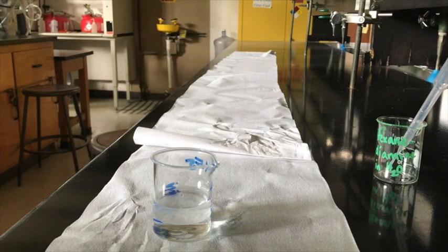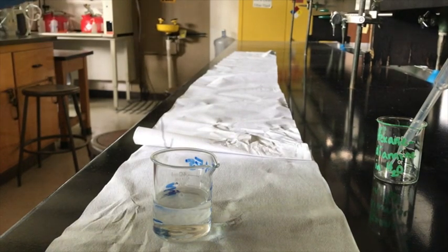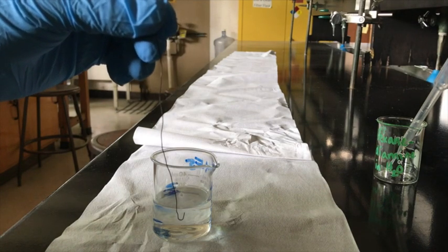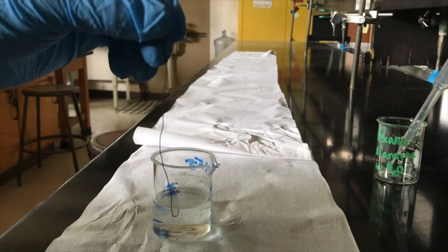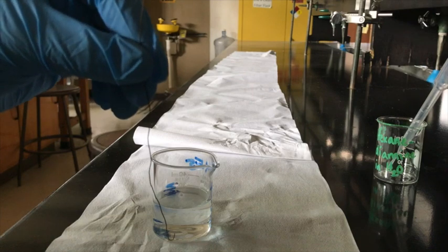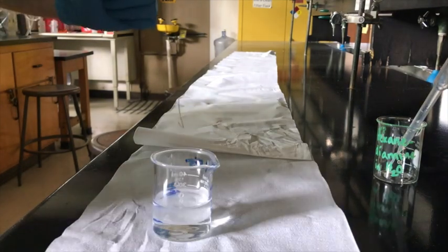Okay, here comes the best part. Wish you guys were able to be here to do it. I've got this piece of copper wire I made into a hook. I'm going to put it in through the top cyclohexane layer with the diacid chloride into the aqueous layer, and then the hook will catch on that film between the two and pull it up. As it does, it'll pull some of the lower aqueous layer through the organic layer, and it'll keep polymerizing into nylon. So let's see how long of a nylon strand I can make.